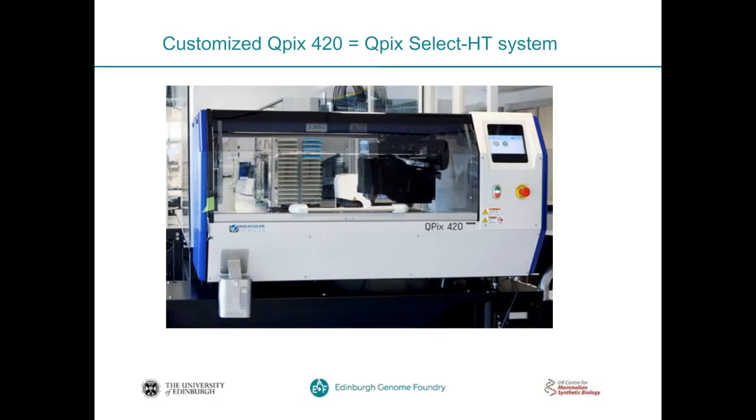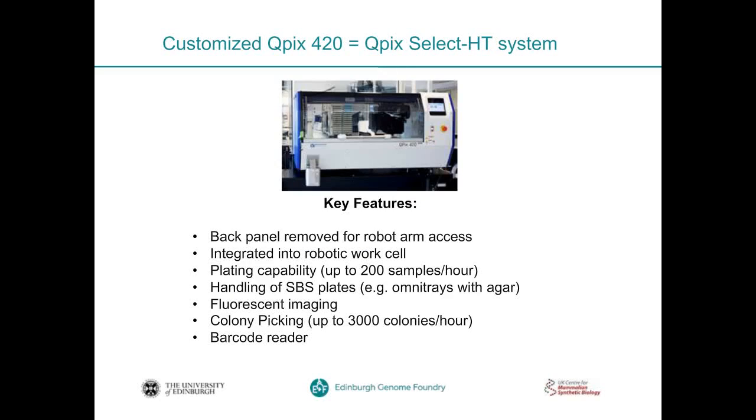Yes, Ivan has explained very well how the QPix fits into our workflow, and I would like to make this a bit more visual for you now. So this is our QPix, and you see the automated platform in the background there. And we work very closely with the thermal design team and the OIS team from Molecular Devices to build the first integrated QPix. So for this, first of all, the back panel was removed so that the Fanuc robot arm had access to the QPix.